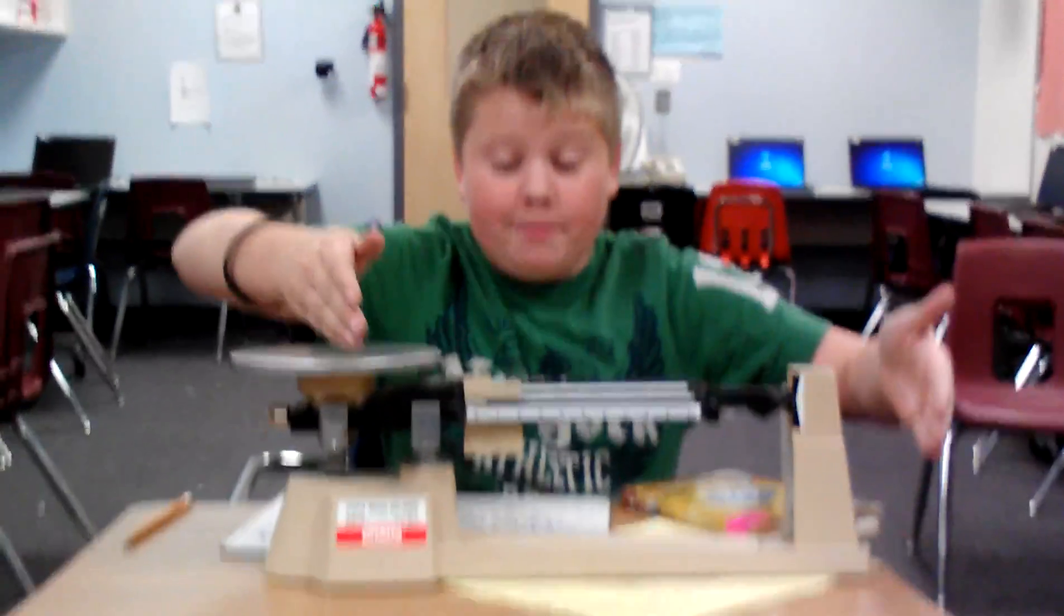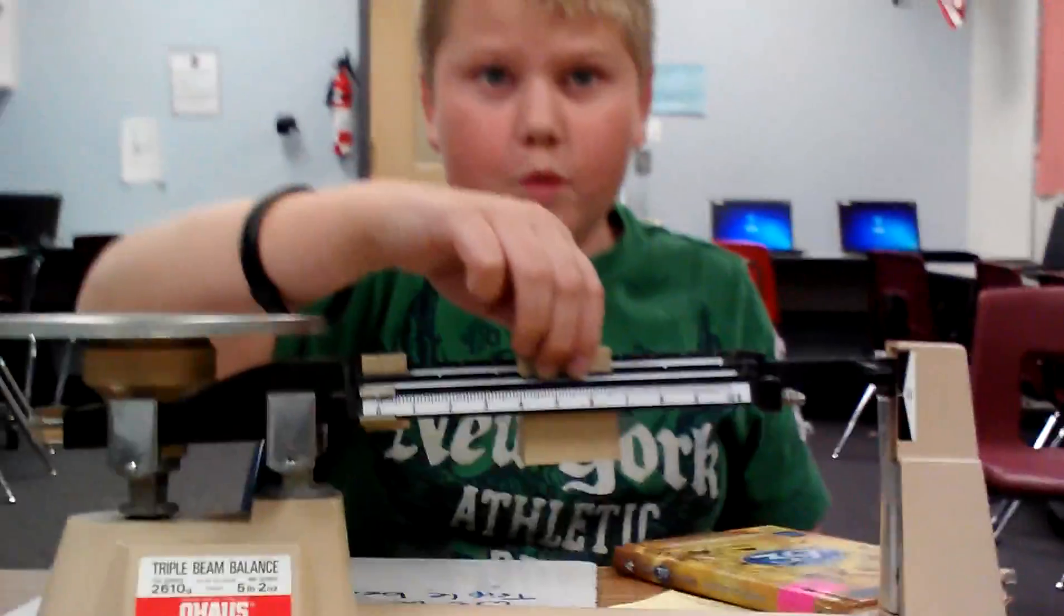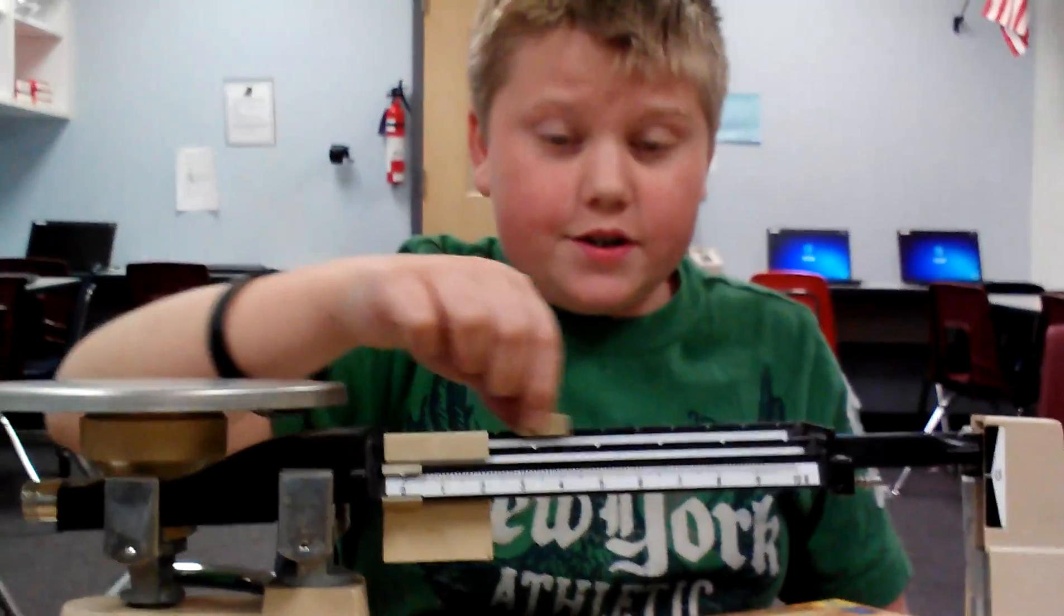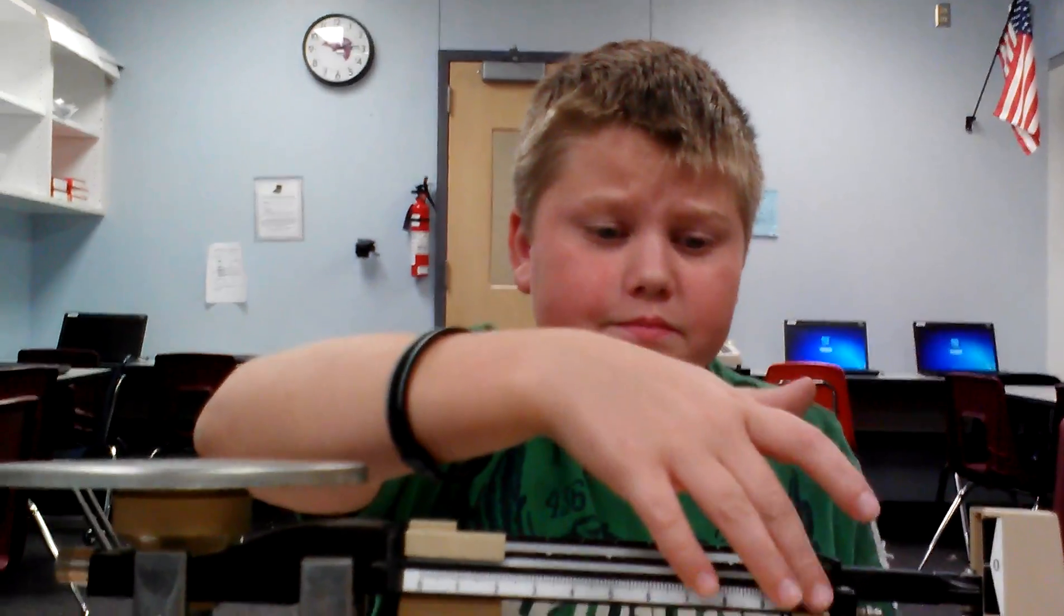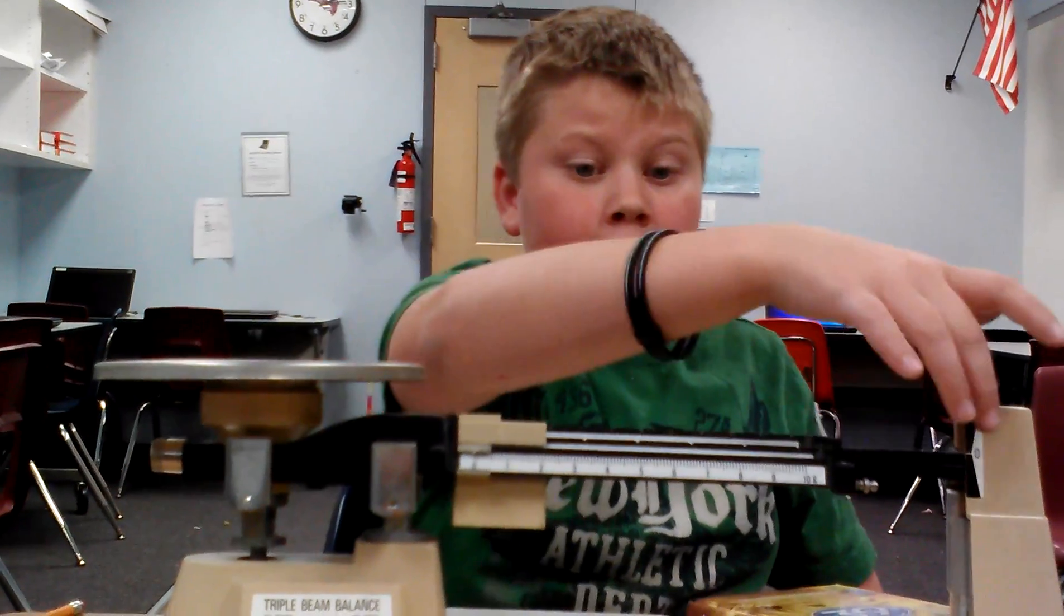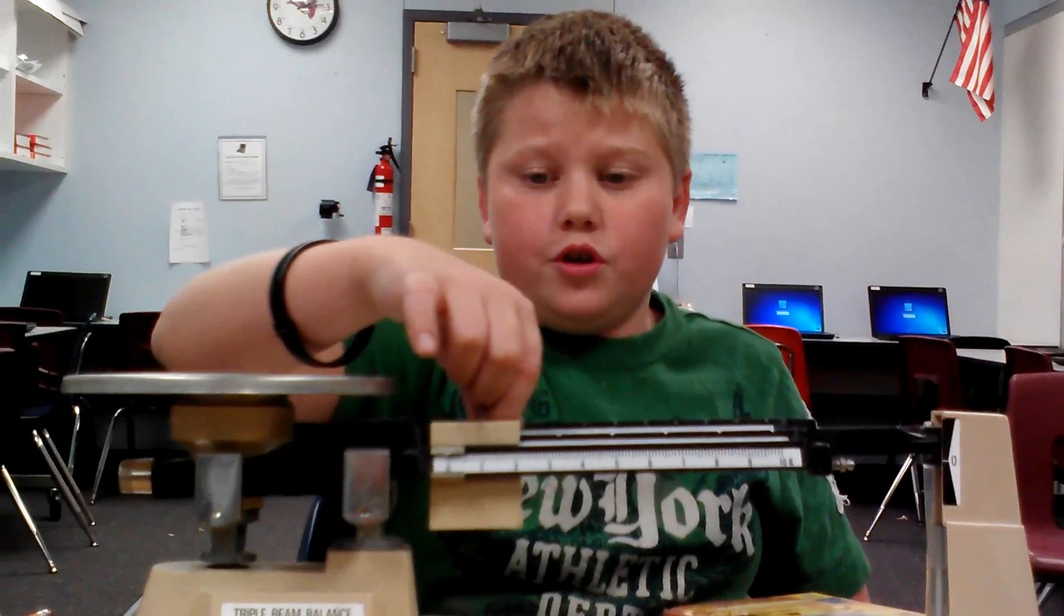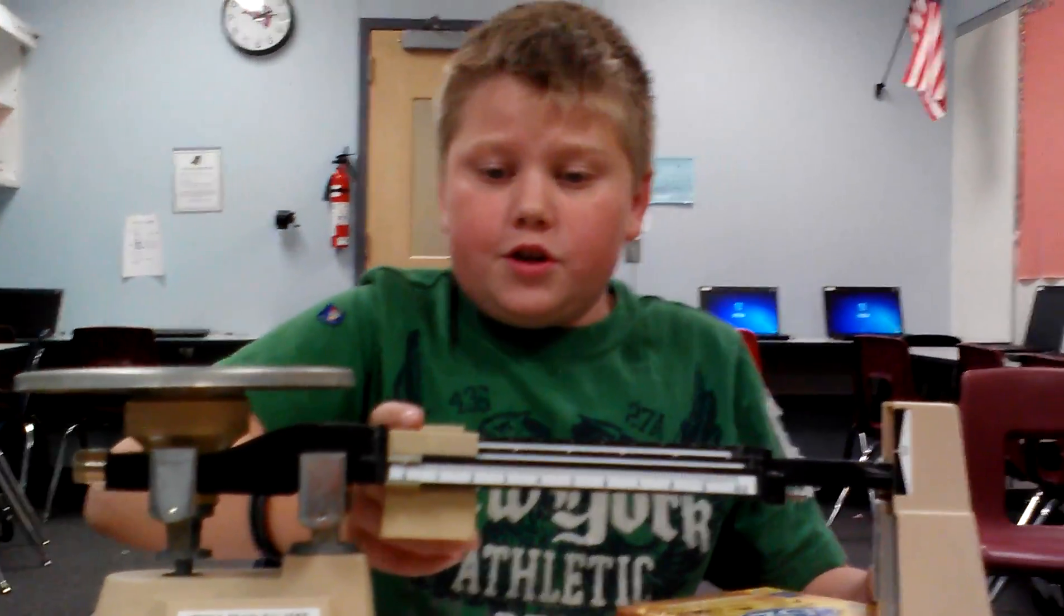This is a triple beam balance. What it does is you have hundreds weights, tens weights, and ones weights. And what that does is once you place your object on here and line it up with zero, what you have to do is you have to move these so you can get the exact object. To show you how you can move this to line it back up with zero, Kelly is going to show you how you do that.